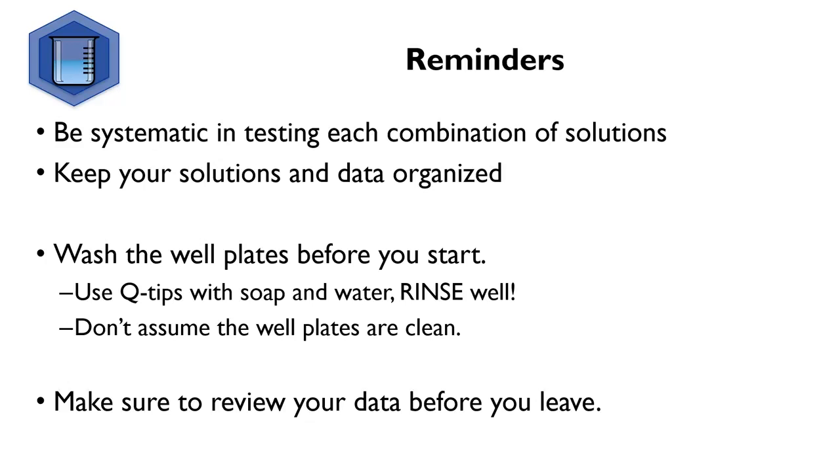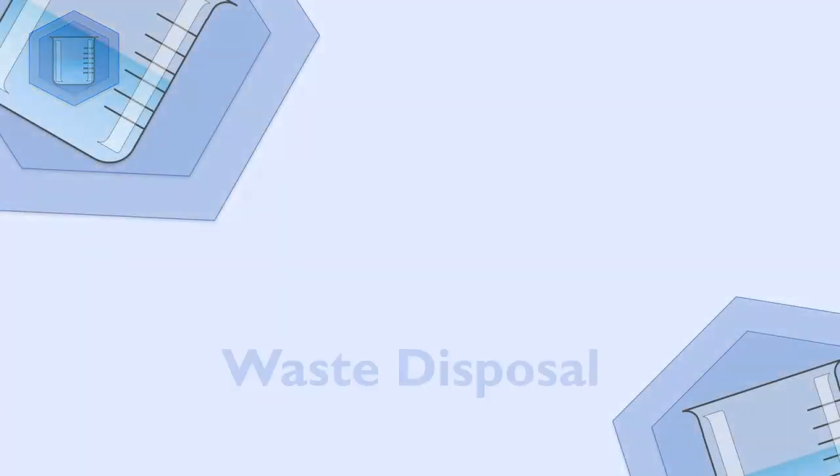Make sure you look over your data before you leave. Once you leave, you won't be able to come back and redo a test, so make sure you have clearly written down your observations and are sure of your results.